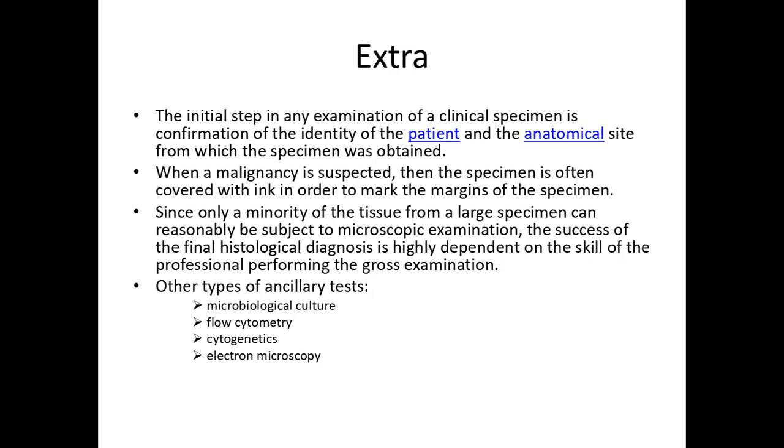So pwedeng hindi niya makuha yung pinaka part ng specimen na nandoon yung abnormal tissues or cells. No? Kaya very important ang grossing. Other types of ancillary tests include microbiological culture, flow cytometry, cytogenetics, and even the use of the electron microscope.